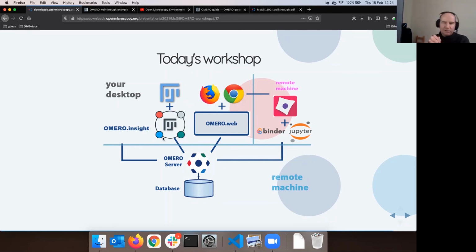The Omero server in this case is the training server, which is called Outreach, and this training server is in Dundee, United Kingdom, Europe. That's where all the data are pre-imported. By the way, that's not the server where I'm sitting. It's somewhere else. It's somewhere else for everybody. And we will use, as I said, Omero Insight to practice importing images into that server.